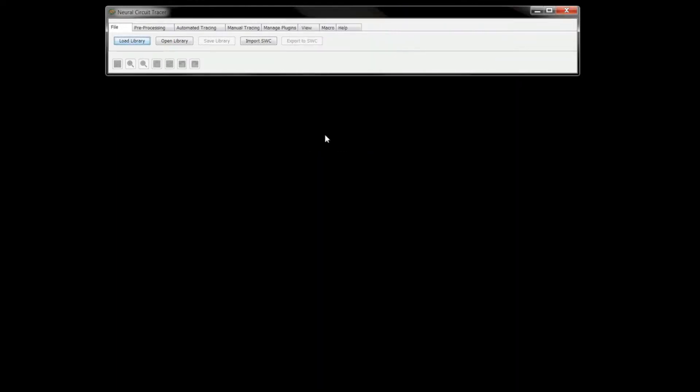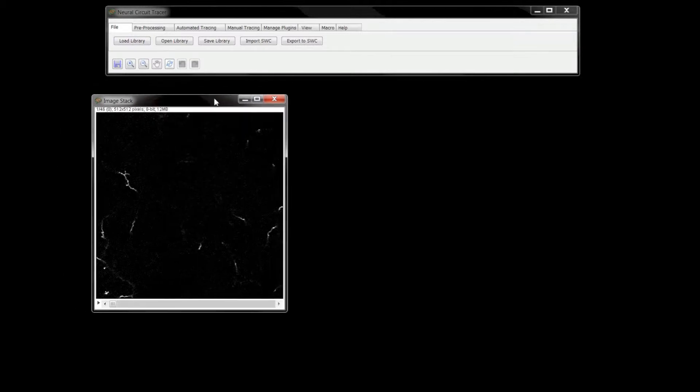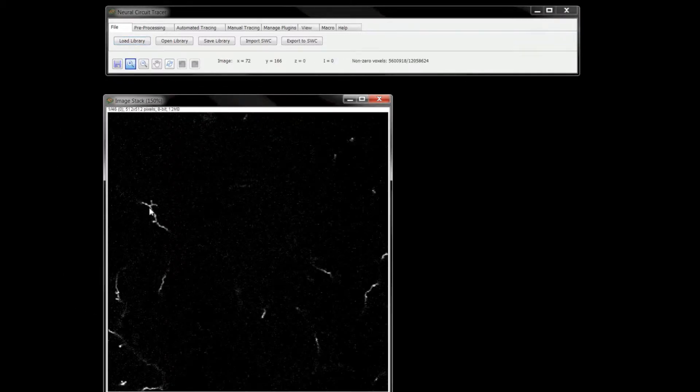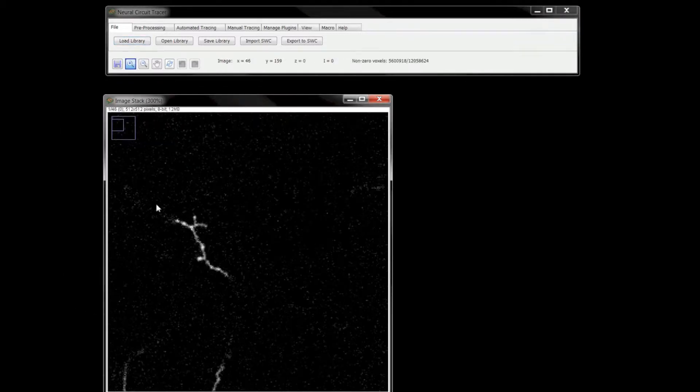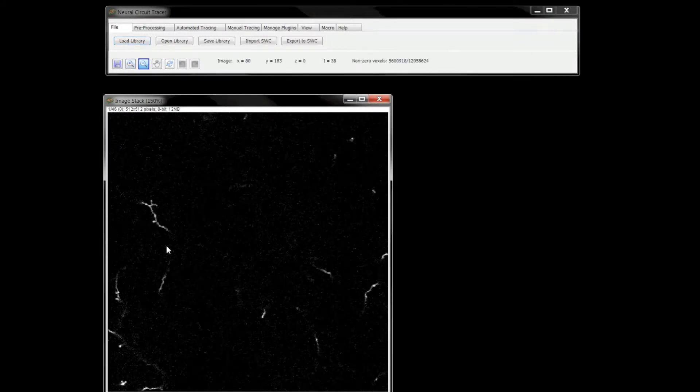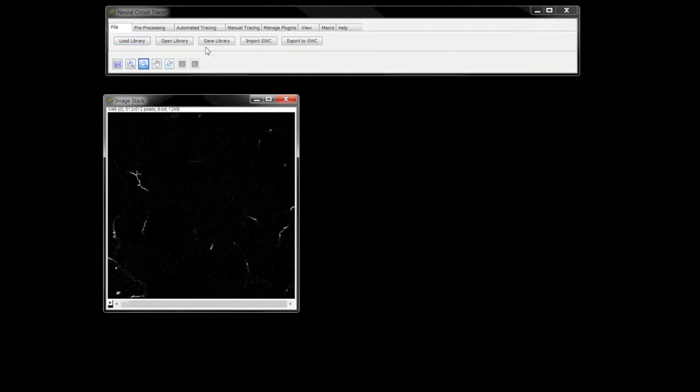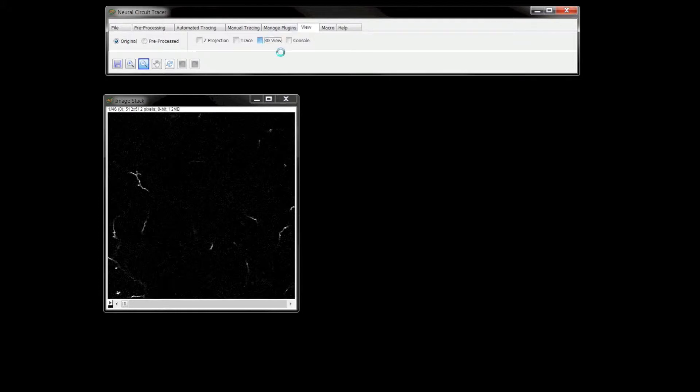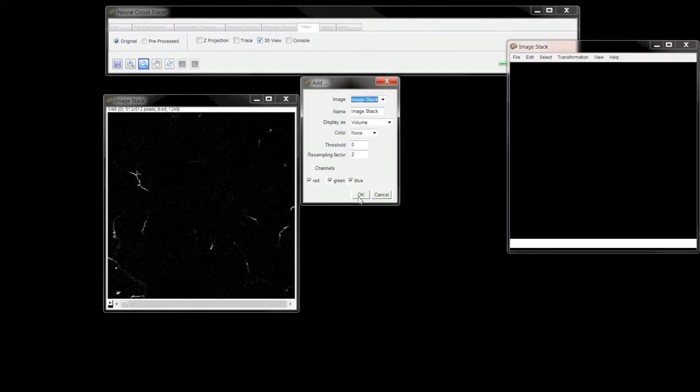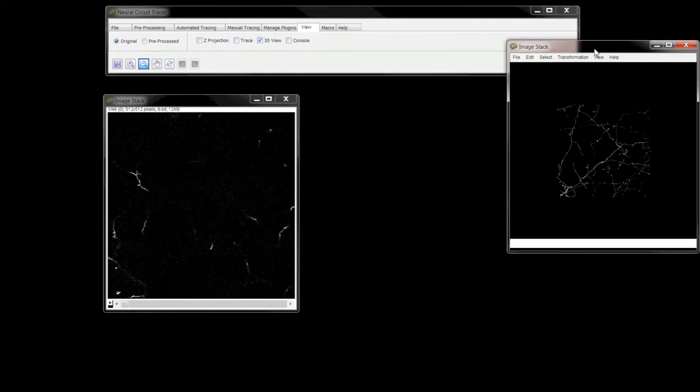Once loaded, the image window allows you to scroll through the stack and zoom in and out of areas of interest. Additional viewing options can be found under the View tab. Here you can open a 3D view of the stack as well as a Z-projection.